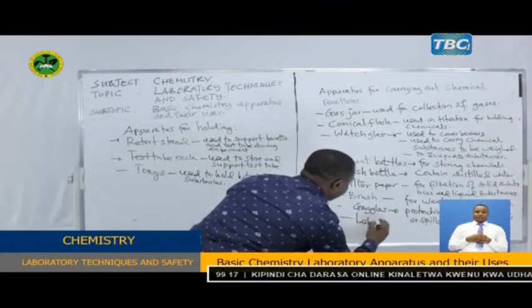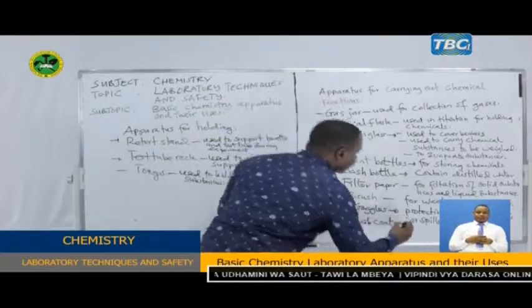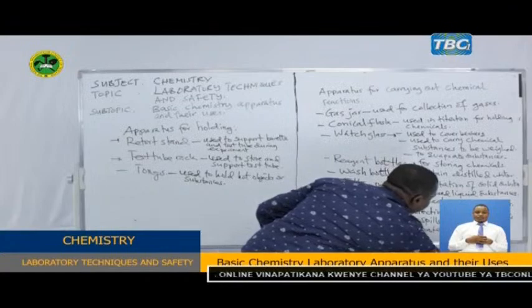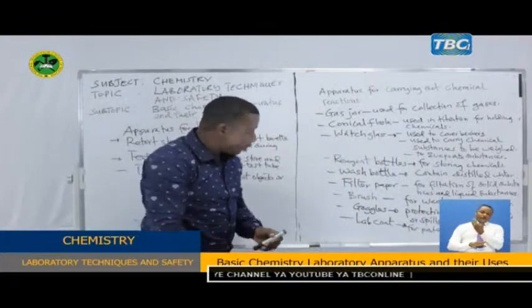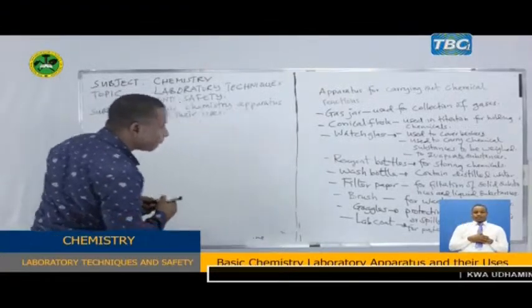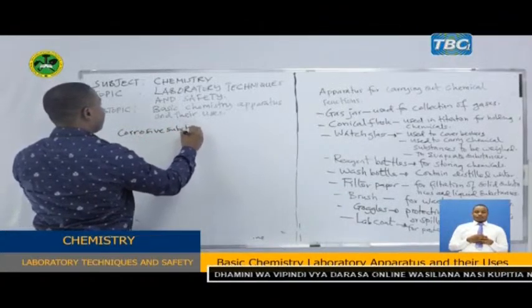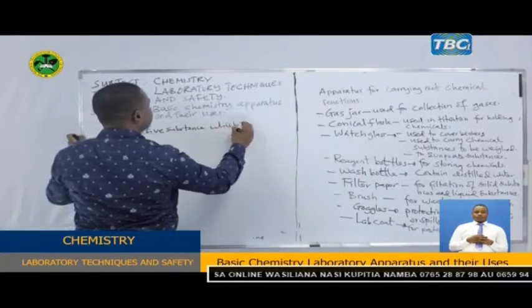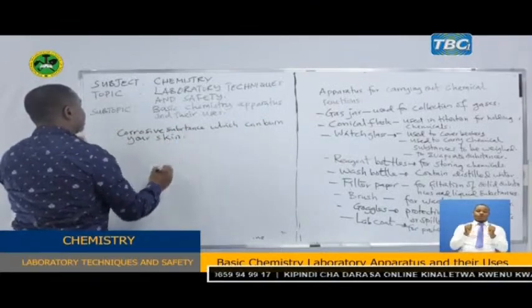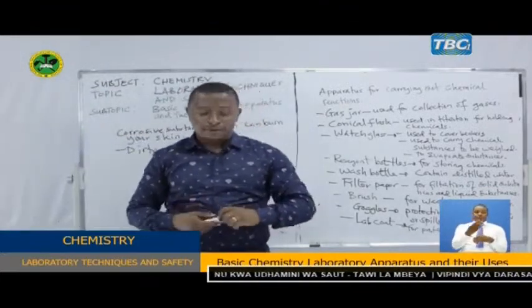So, lab coat, for protection against corrosive substances which can burn, or from dirt that can dirty your clothes.